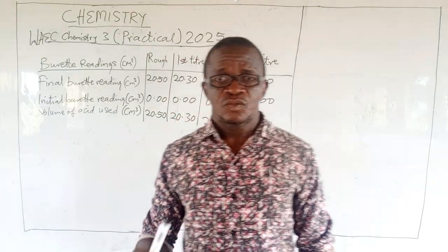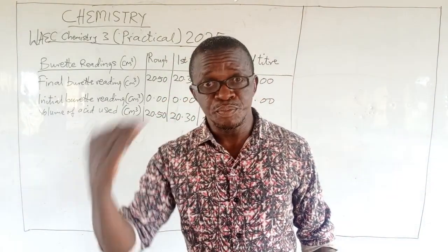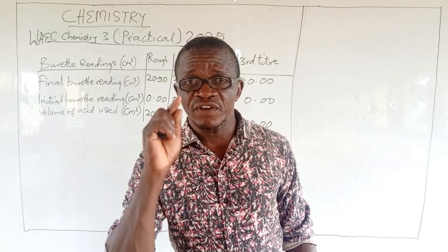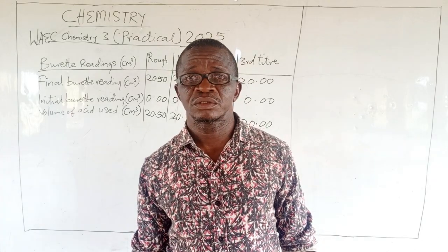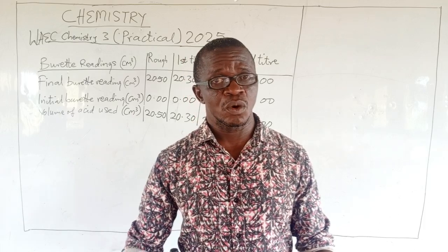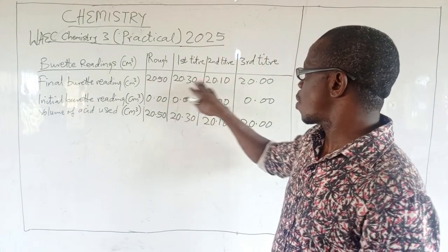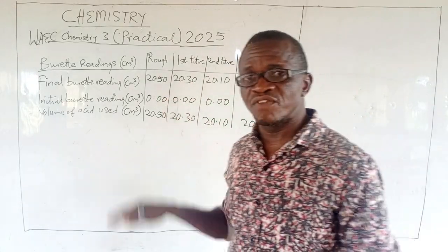Okay, now moving to alternative A or B, as far as question 1 is concerned. Question 1 is quantitative analysis. In a simple way, titration. They will give you questions, give you substances that you are to use, acid and base, and titrate, and then get the values. You may be thinking of how I got these values. Forget about the values.